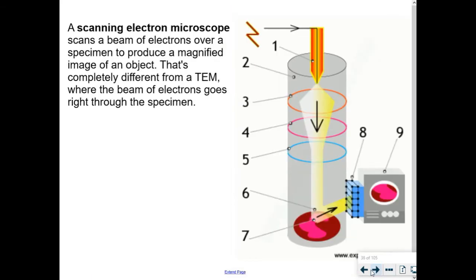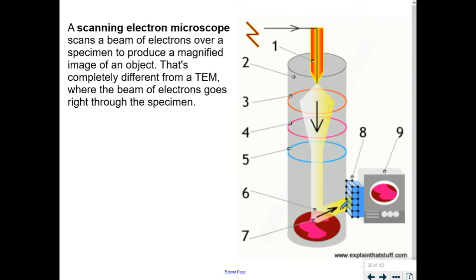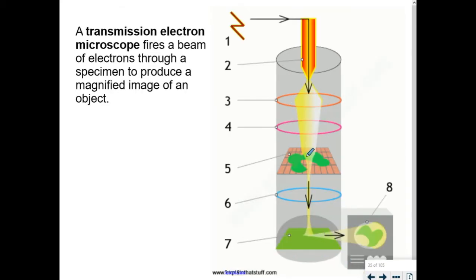And again, the point I want to make with these slides right here is that it's all about whether electrons go through or whether electrons bounce off. Okay? The electron machine that measures it is basically a computer that records in binary. You guys know what binary is, where it's like a 1 or a 0, it's on or off, right? This one right here I think is the best way of describing it. Either the electron goes through or it doesn't, right? And based on that, the binary code that ends up getting shown on the bottom of the screen here basically makes a computer signal that computers then use to make an image.